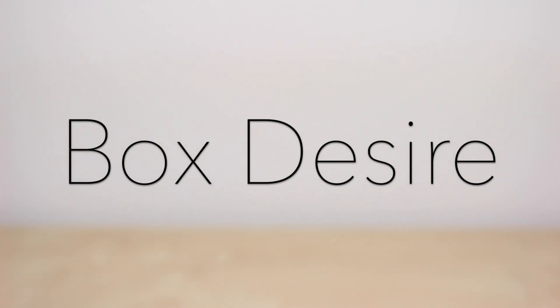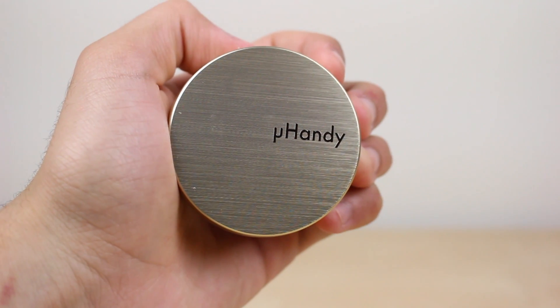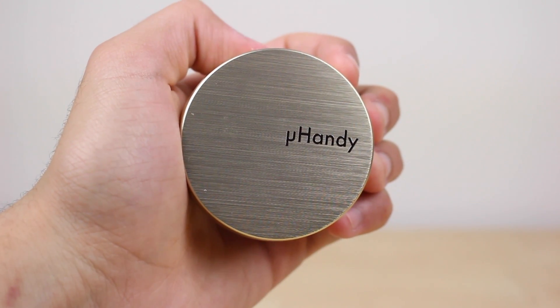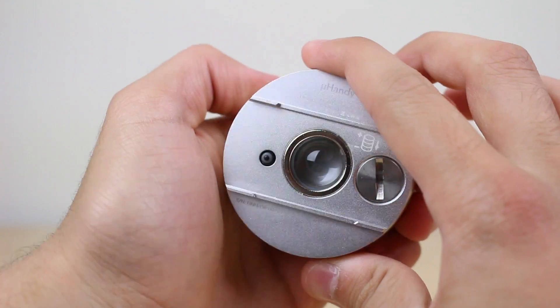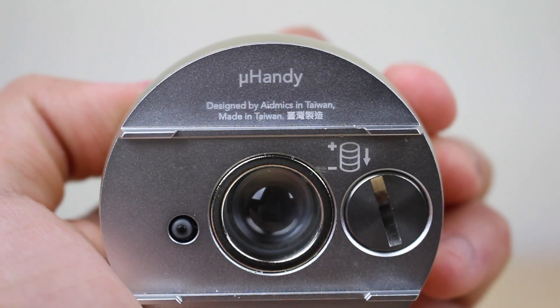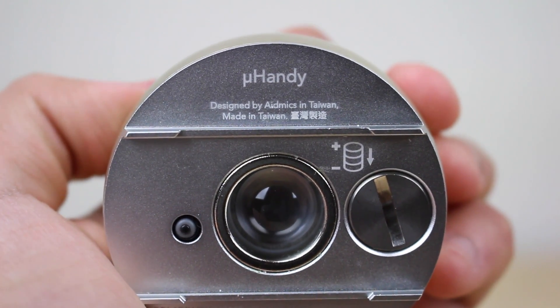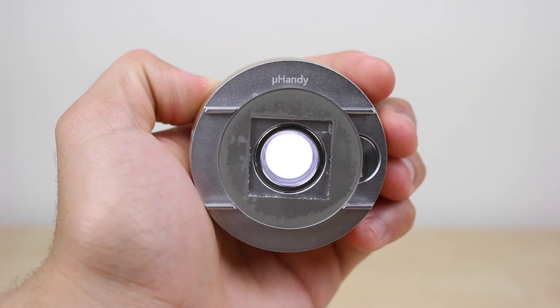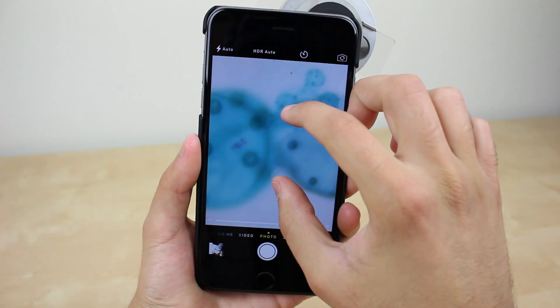Hello everyone and welcome to the Voxdesire. This is the U-Handy, a tiny device that turns your smartphone or tablet into a portable microscope. Created by the 8Mix team in Taiwan, it seeks to simplify the traditional microscope with a single lens transmitted light that works in conjunction with the camera of your device.